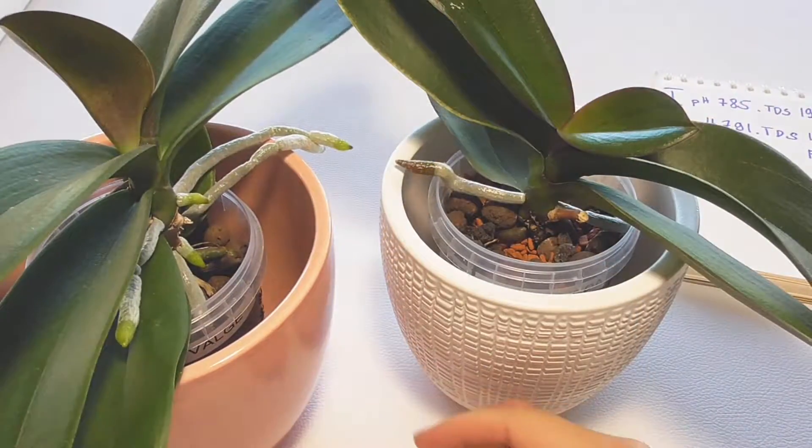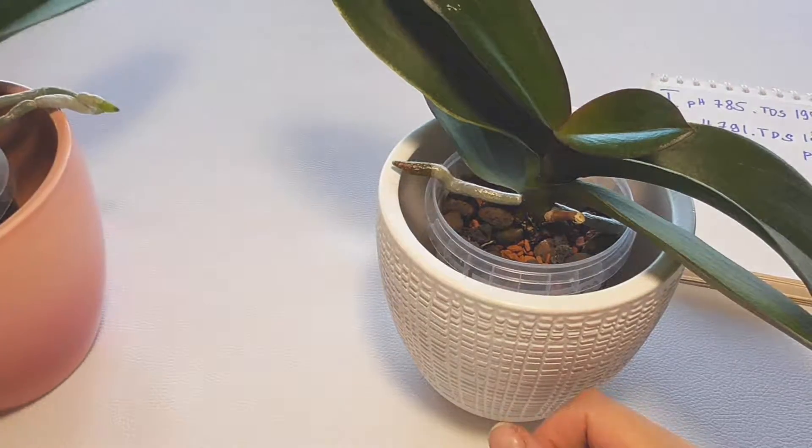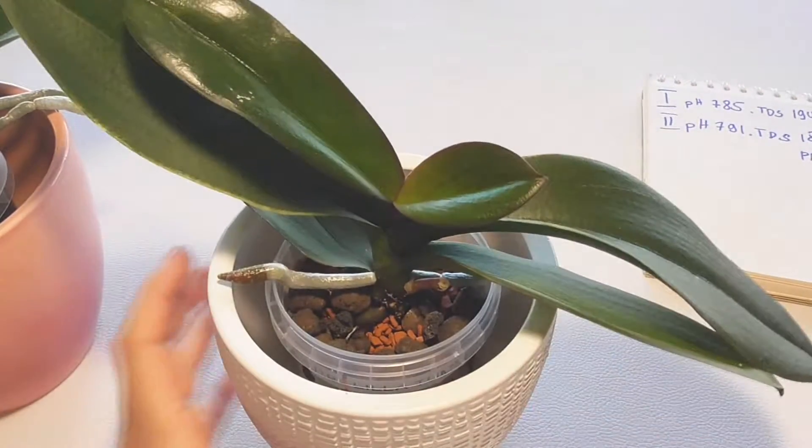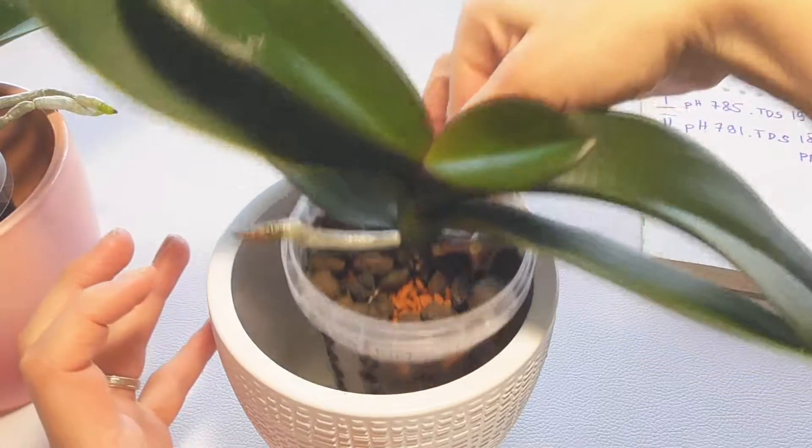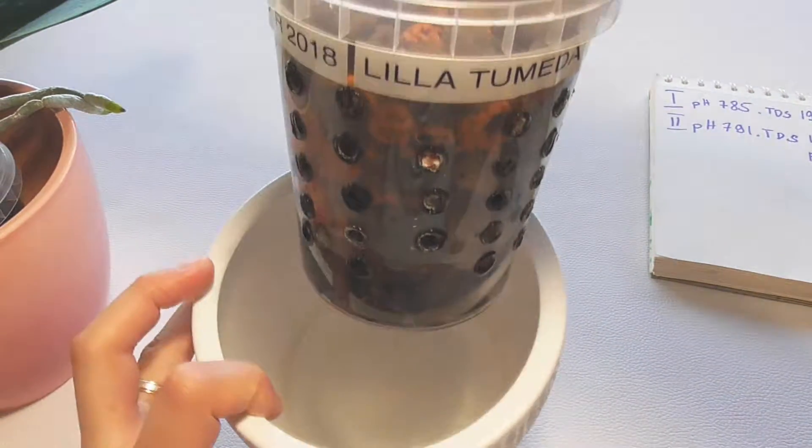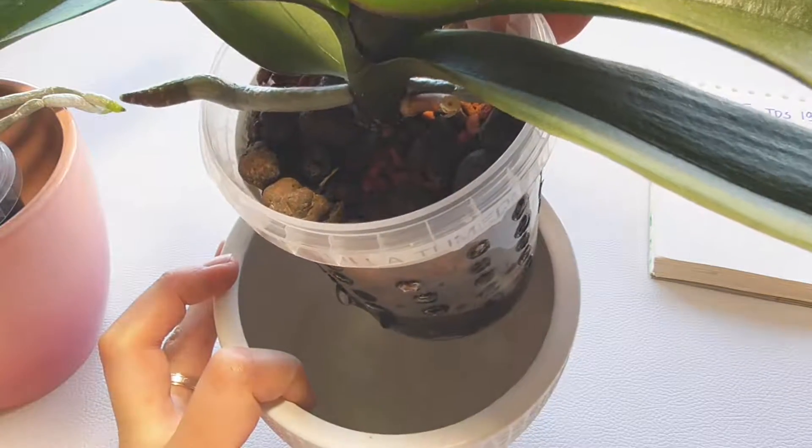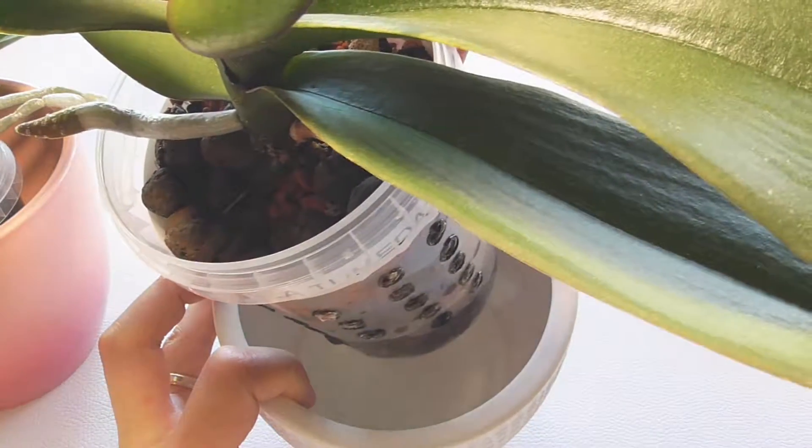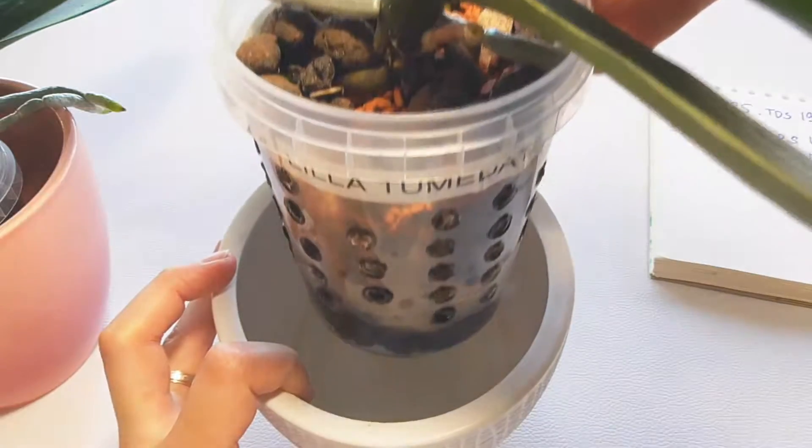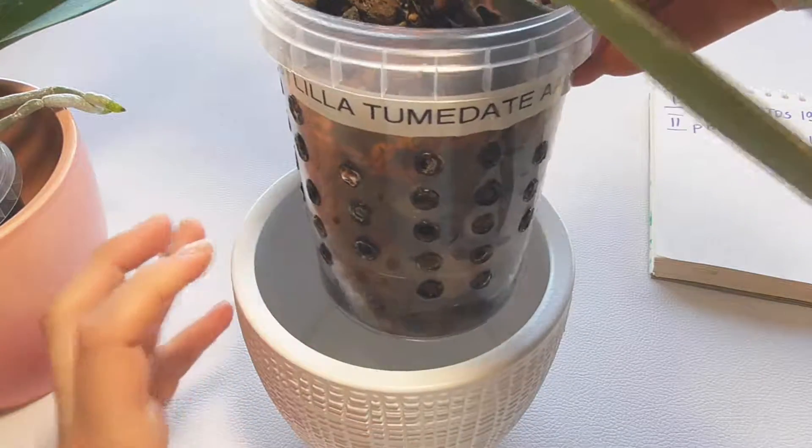I personally bought these pH and TDS portable meter testers for my orchid collection. I grow my orchids in semi-hydroponics. This means the plants are potted using LECA clay pellets.